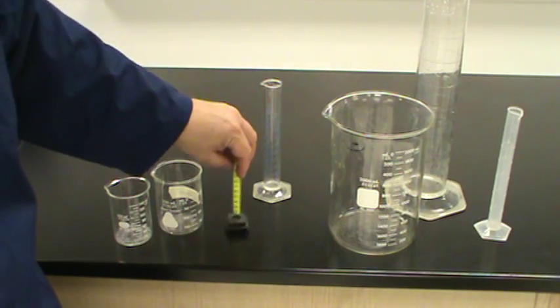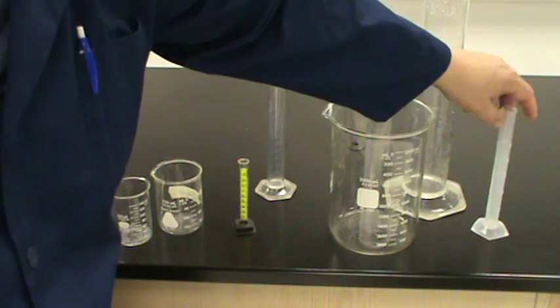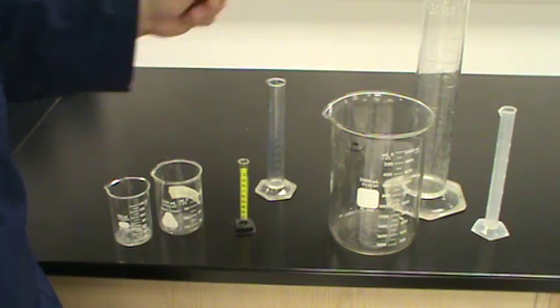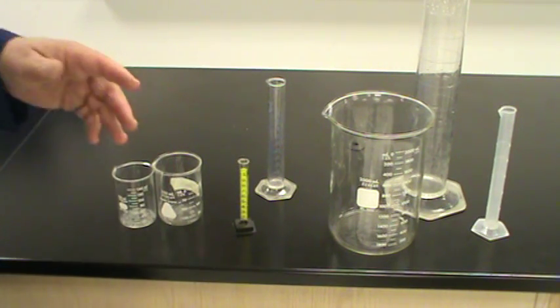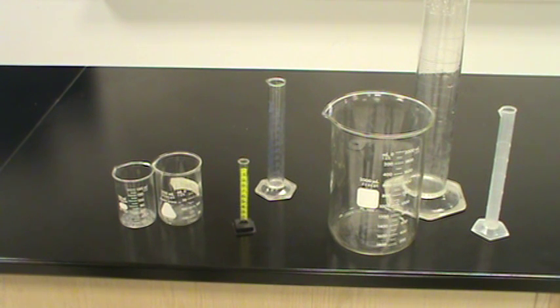And we have all different sizes. We have as small as the 10 milliliter, we have 50 milliliters, we have a 25 milliliter plastic one here, all the way up to our two liter and thousand milliliter versions, and then the beakers the same way. So we've got a variety of different instruments for you to use to measure liquid volume. And when we come back, I'm going to work the third practicum on actually measuring liquid volume.